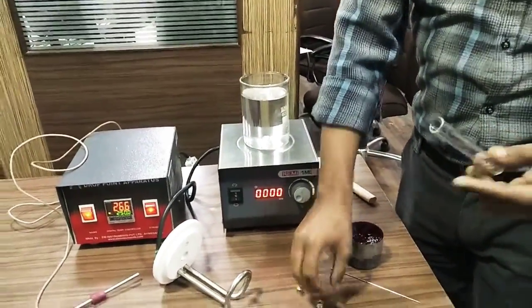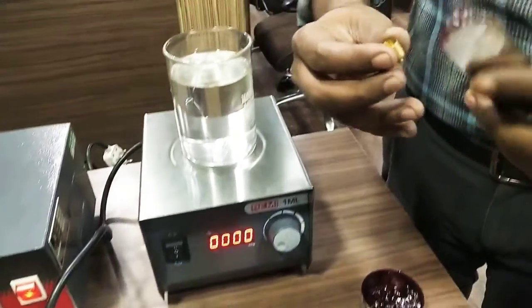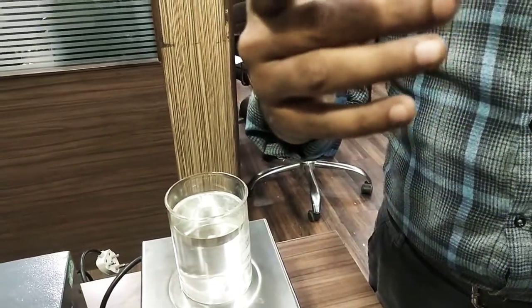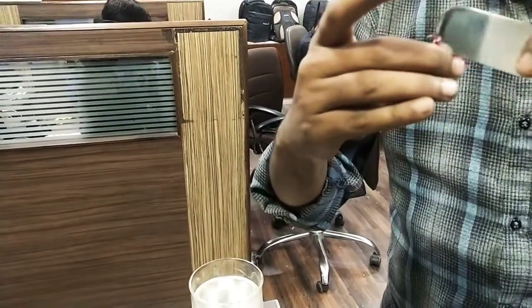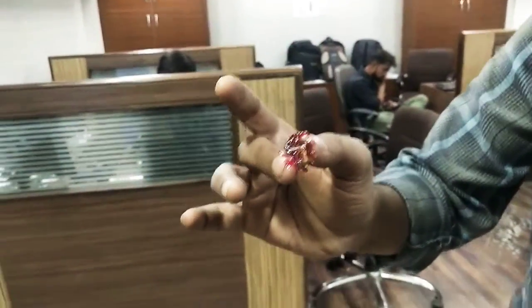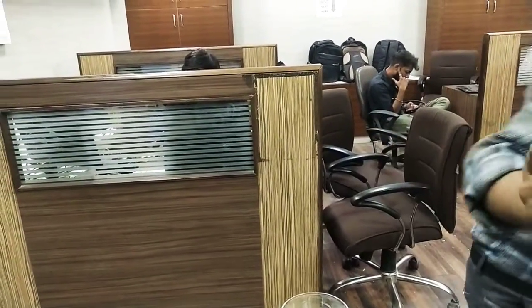We have to fill the sample in the grease cup. We have to make sure that the bottom hole is filled with grease. After that we have to clean the excess grease. Now the bottom cloth.